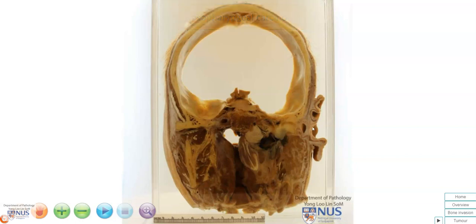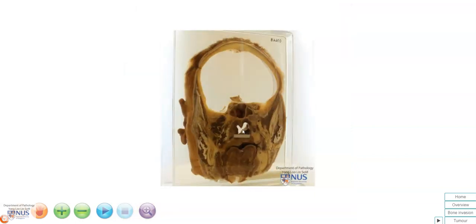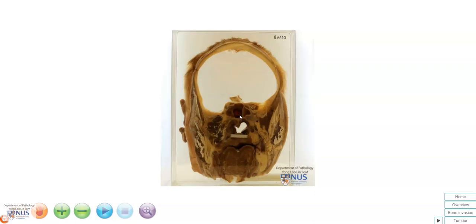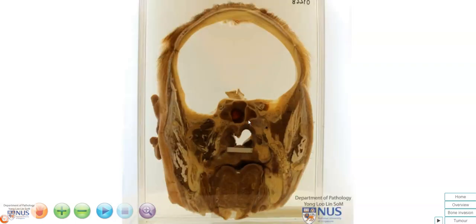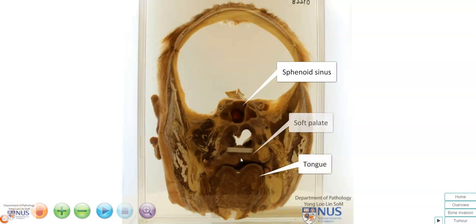We have part of the right ear here. This is the anterior view and we can see here the sphenoid sinus. This is the region of the midline. This is the tongue and this is the soft palate.